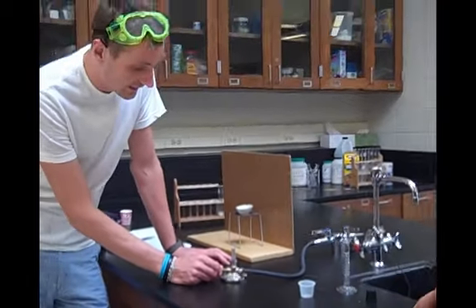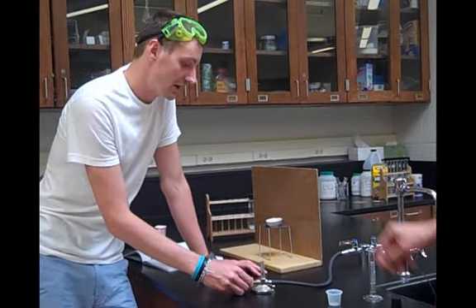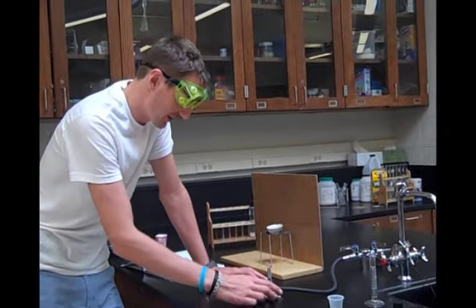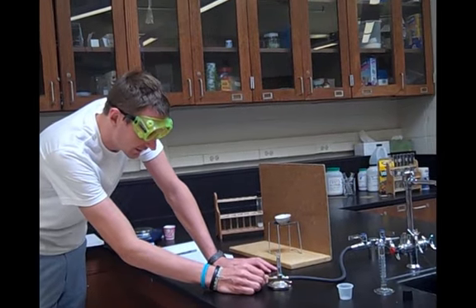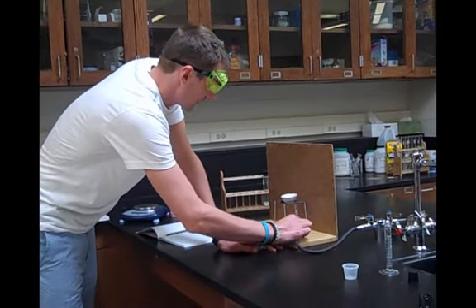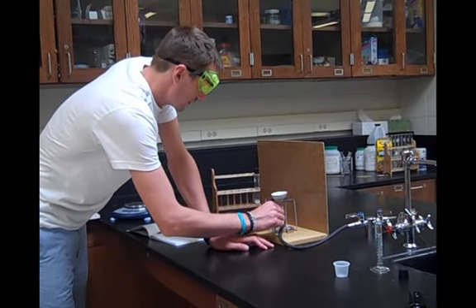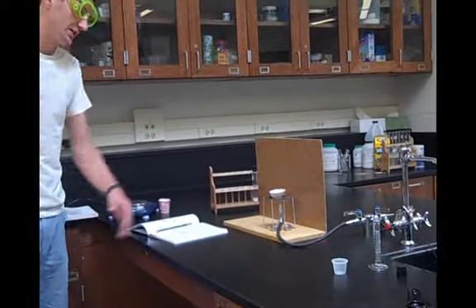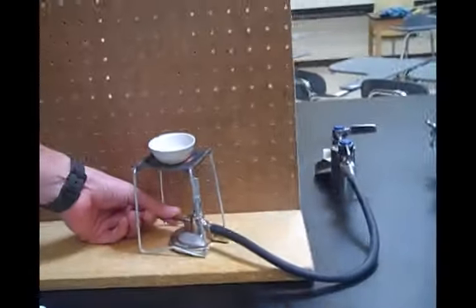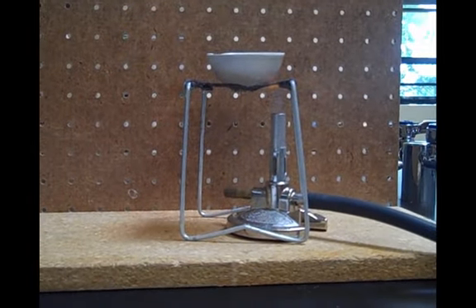Now when you're heating your evaporating dish with solution, you don't want to have it on a very high heat, and you want to have your goggles on, and you want to make sure the flame is low and indirect because you don't want your solution to start splattering. So put the flame not directly under, that's what we mean by indirect heat, and let it heat up until it is just a solid.